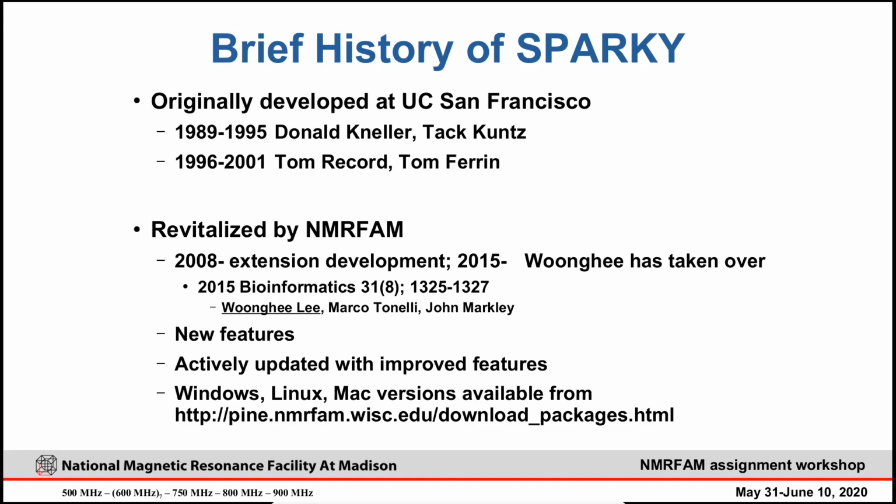Since that time, even though Sparky has been one of the most popular software packages among NMR spectroscopists, development has not been active.